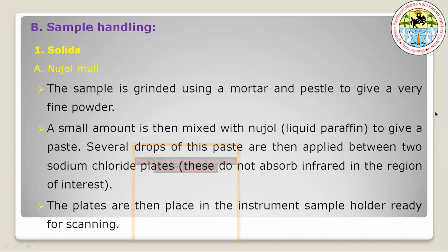Your purpose now. Okay, sample handling. As I told you earlier, when you would like to analyze your sample with an X-ray spectroscopic technique, your sample should be present in solid form, either in solid powder form or in amorphous powder form. Whenever you would like to analyze a sample with NMR, your sample must be present in solution form.